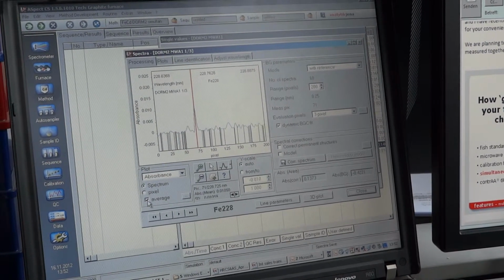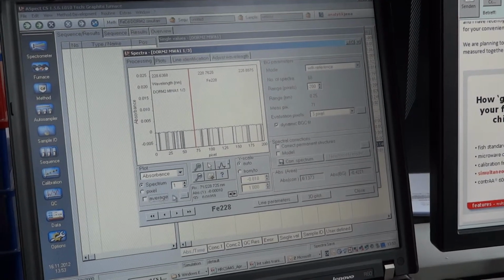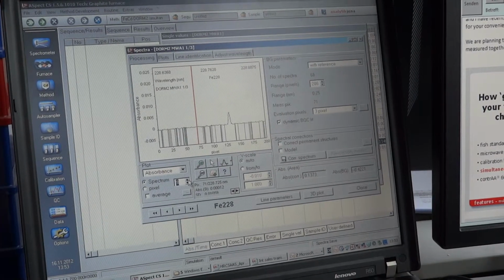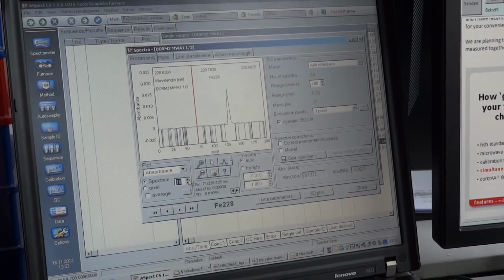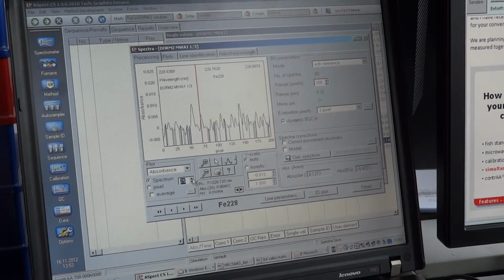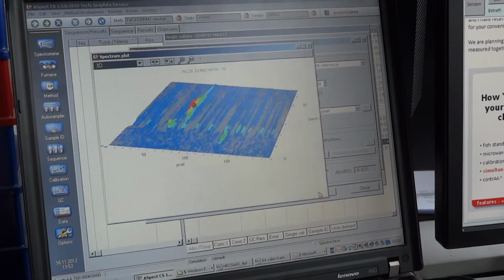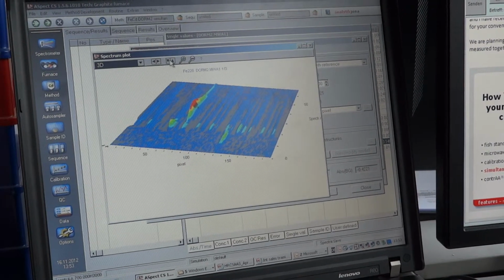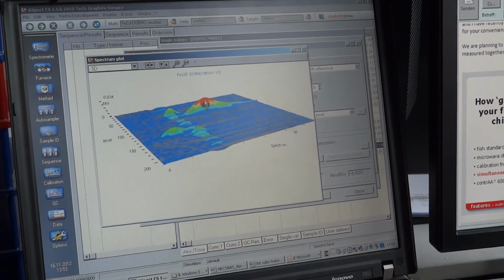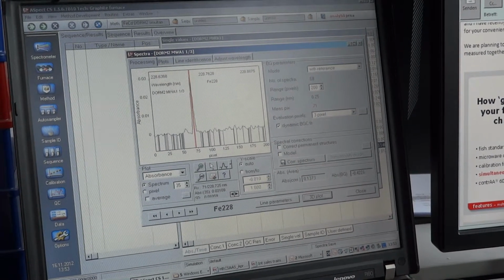And so do you analyze your sample. So this is cadmium and iron in a fish matrix. So we have some organic material, but if we scroll through the spectra, we will see cadmium coming up again, and then it goes down, the matrix coming in, and then that goes down as well, and the iron comes up. You have the chance to look at it in three dimensions. So this is one matrix, and you can also use the correction model for two lines.